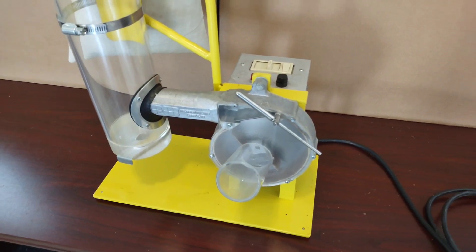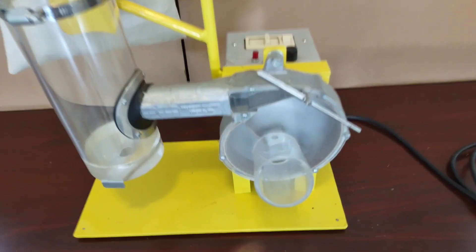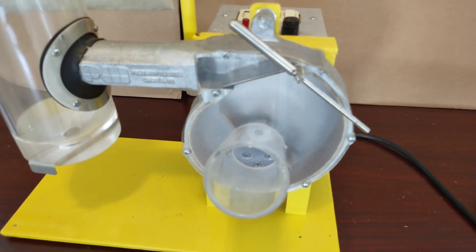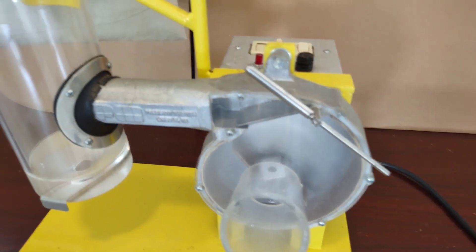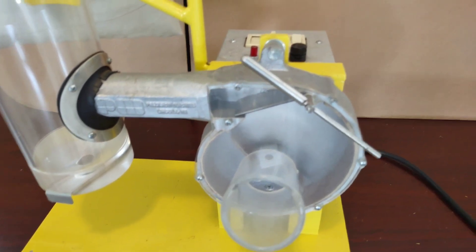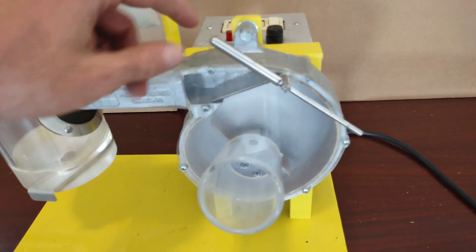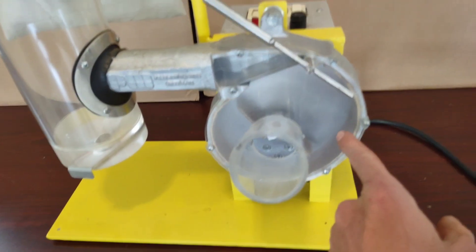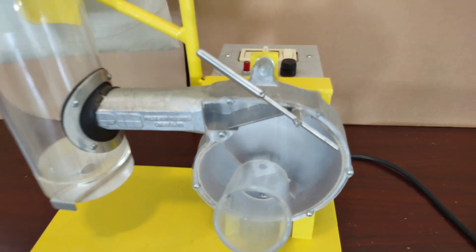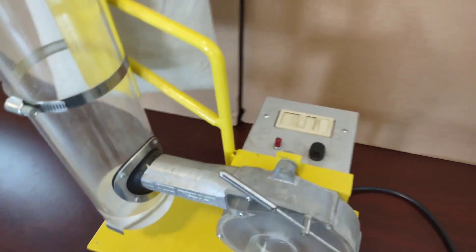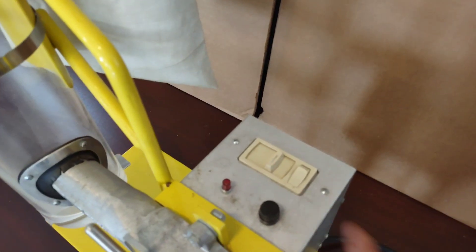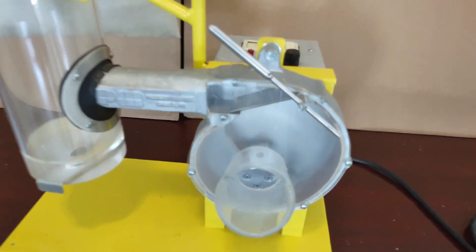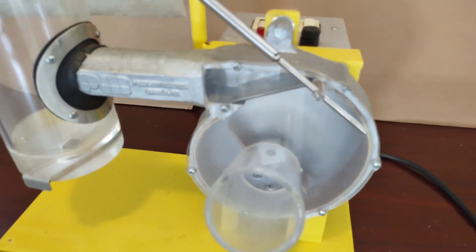The unit features a clear plexiglass side so you can see the threshing process. It also has an adjustable weight to control the dwell time that the heads are in the threshing chamber, and a rheostat knob for adjusting the speed of the threshing impeller on the inside.